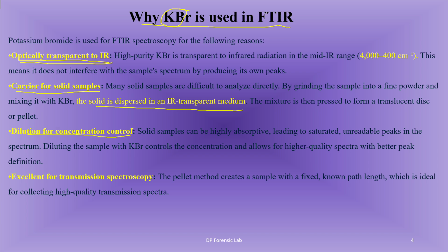If the concentration of the sample is high, it does not allow the IR to pass, so KBr dilutes the sample and the IR can pass easily. It is excellent for transmission spectroscopy. The pellet method creates a sample with a known path length, which is ideal for high quality transmission spectra.